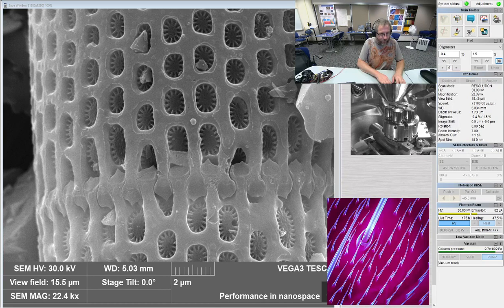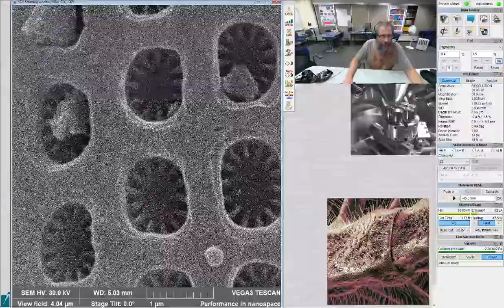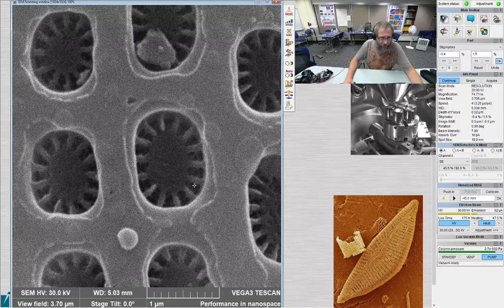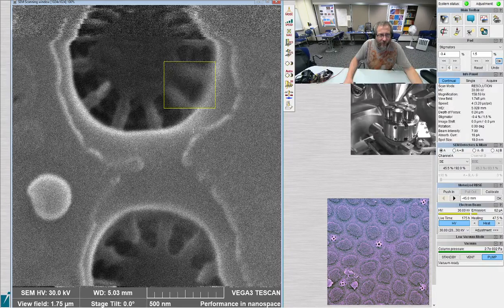These are actually kind of interesting to me. Again, they're not perfectly spider webs. They have some sort of crossbars in here, hiding in here. I can't quite focus on them because they're just a little too small, and my stigmation is just a little bit off again.